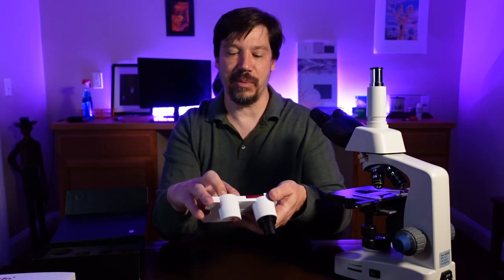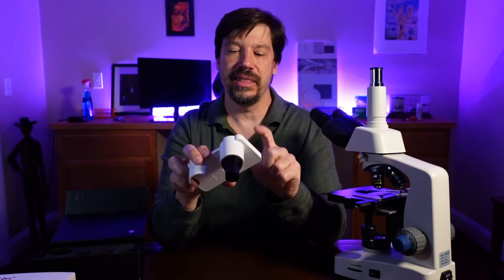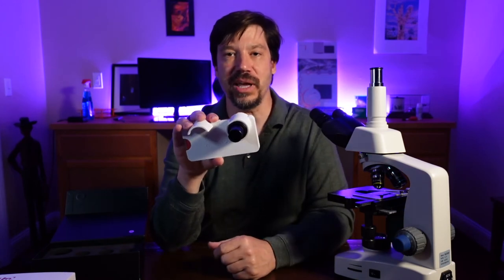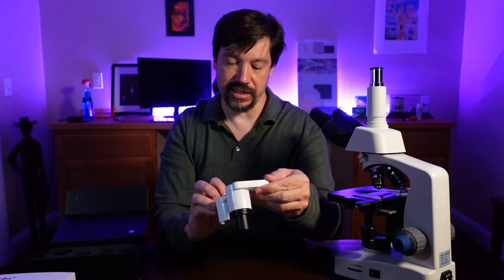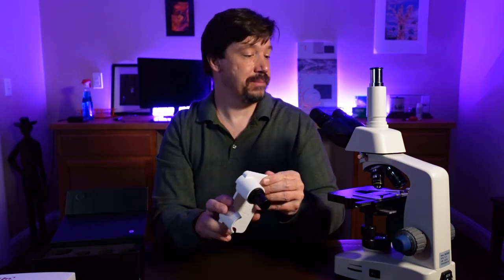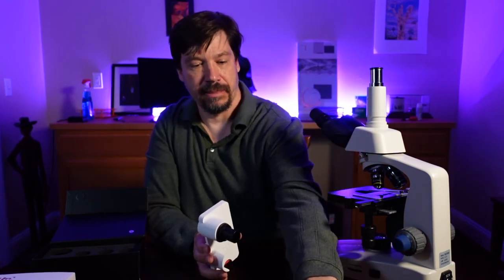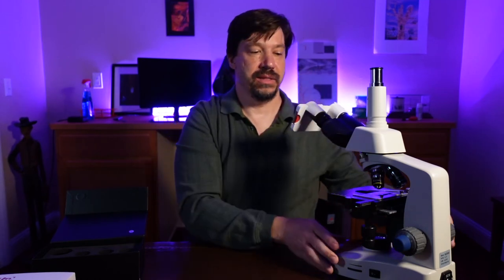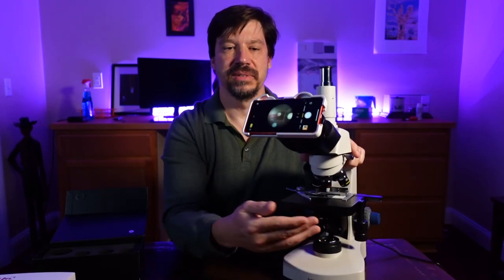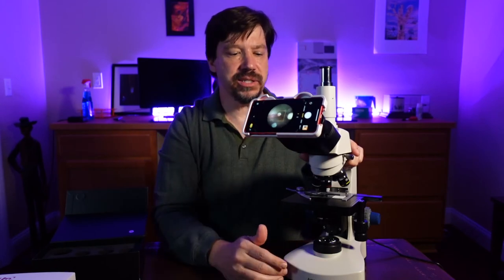Now we take our iPhone and just pop it right in. This fits absolutely snugly and secure — just like an iPhone would fit into a protective case — really nice fit. Let's open up the camera. I'm just going to remove an ocular lens and slide this in. There we go — that's how it looks. It's really nice and secure; it's not moving around and it's really easy to use.